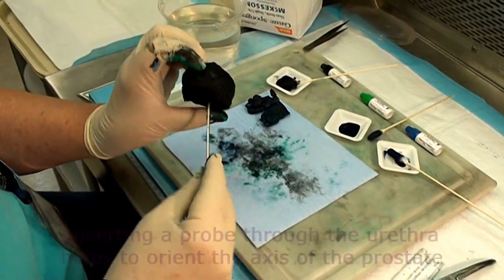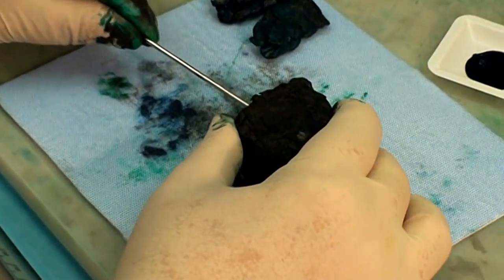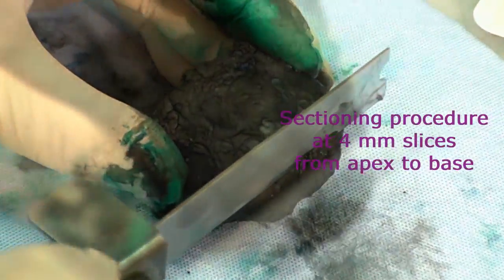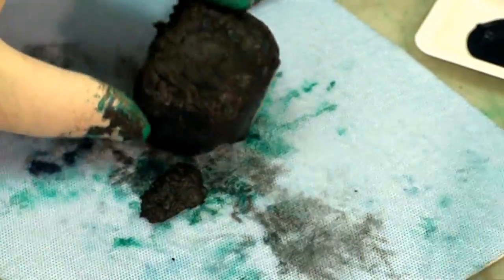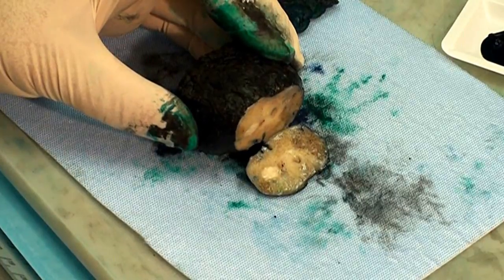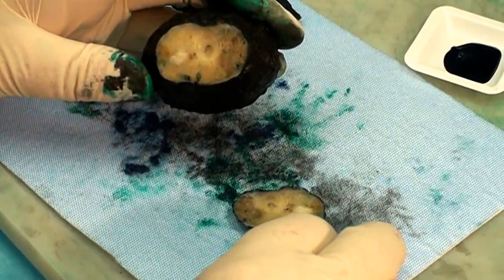One way, if you're not real certain of what the correct plane is, is to stick a probe through here — you want to be perpendicular to this plane, and that's how you figure out the correct path to cut. We're going to start at the apex and bread loaf it. I used scissors to make the final cut so it doesn't tear into that outer margin. So this is the first cut. You can very plainly see the nodules.